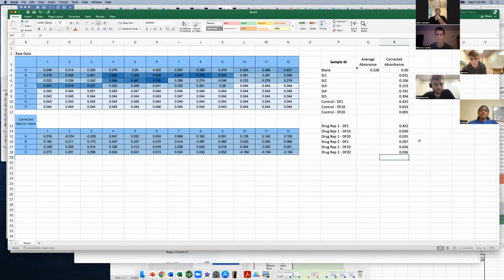Okay, everyone good so far? Okay. So I suppose what I forgot to put in here. Nah, I'll just put it over here. All right, concentration of protein. Okay, everyone's still good?